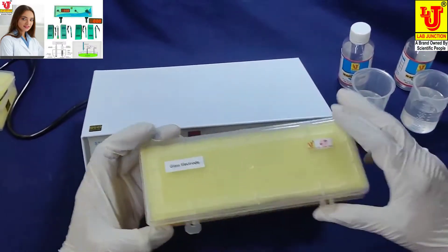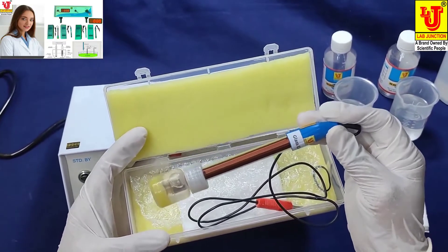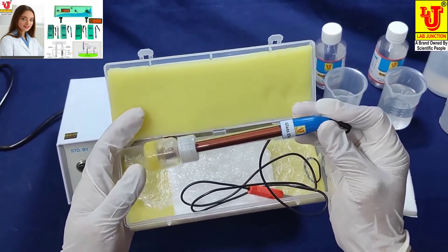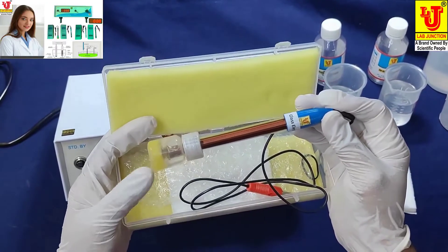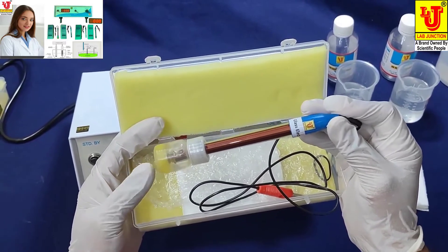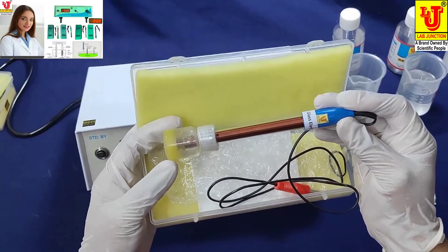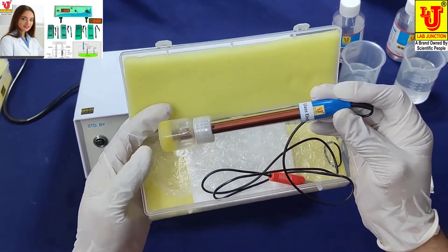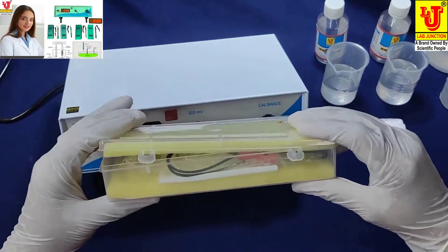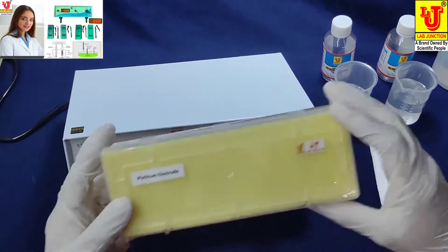This is our glass electrode. It is supplied with a charger capsule bottle. When you have to use this electrode, please remove the charger bottle. The charger bottle is only used for storage purposes to preserve electrode life. And this is our platinum electrode.